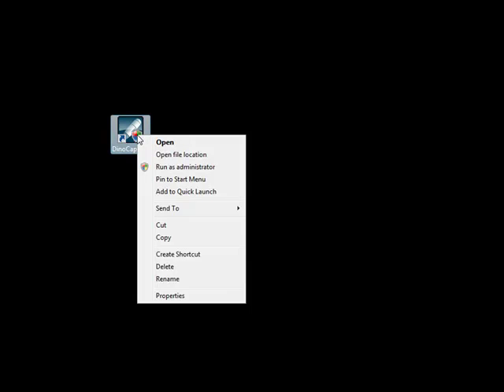This is an instructional video showing how to use the DinoCapture software with your DinoLite microscope camera. To open the software in Windows, double-click on this icon. In Vista, there's an error message that may pop up. To avoid this, right-click on the icon and select Run as Administrator.